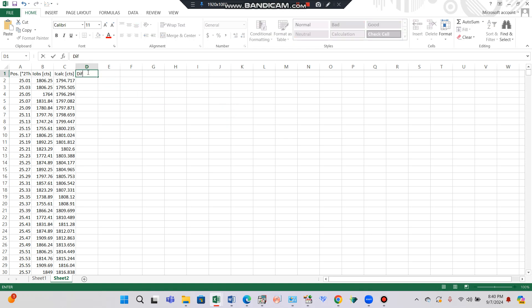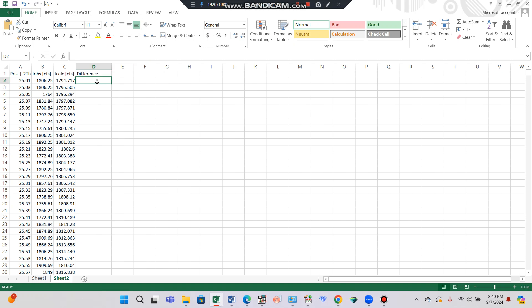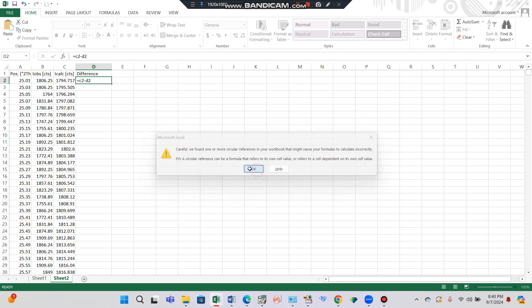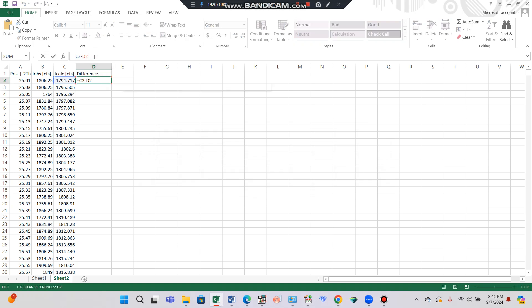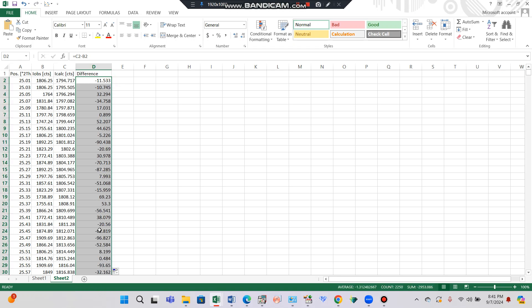Now we want to calculate the difference. Type 'difference' as the column header. Click the cell and enter an equal sign, then calculate the difference between I-calculated and I-observed: enter the formula as C2 minus B2, then press Enter. This gives the difference between I-calculated and I-observed. Place the cursor at the lower right corner and when you see the plus sign, double-click it — the formula will copy throughout the entire column.